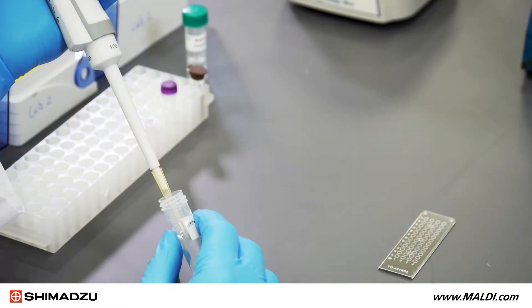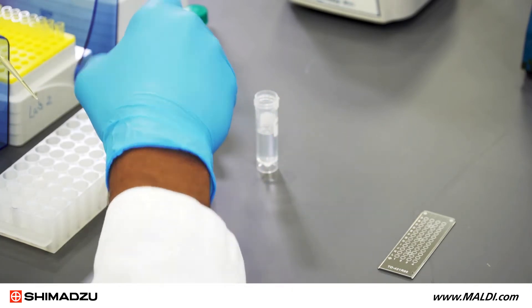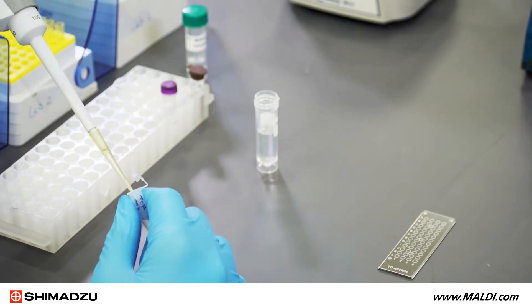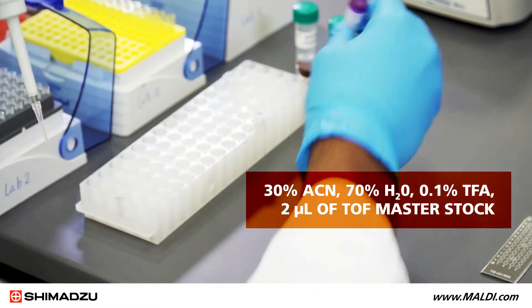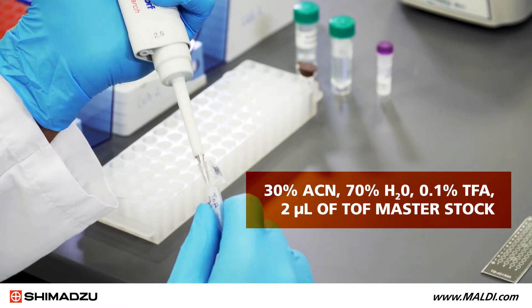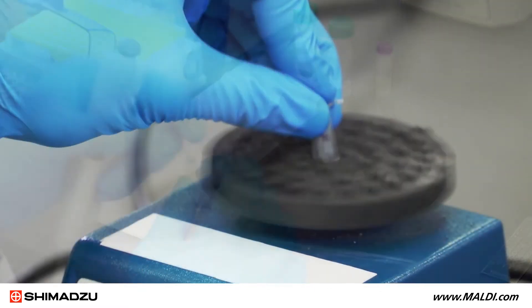For the sample solution in this demonstration, we will prepare a working stock of TOF QC Standard from the LaserBioLabs Kit. In a new tube, add 23 microliters of sample solvent consisting of 30% acetonitrile, 70% ultrapure water and 0.1% trifluoracetic acid, and 2 microliters of TOF Masterstock. Vortex this sample.